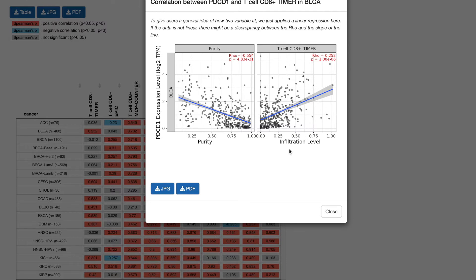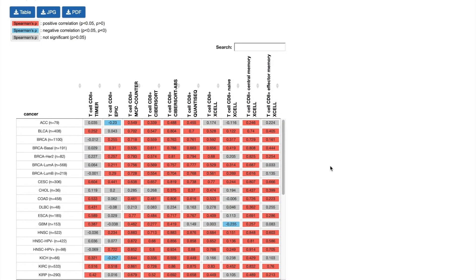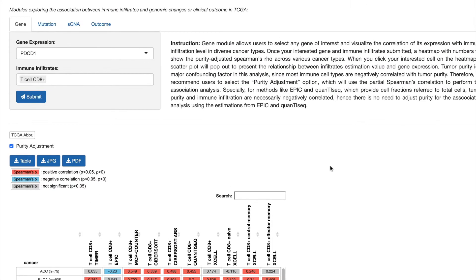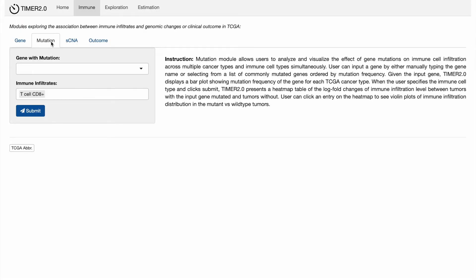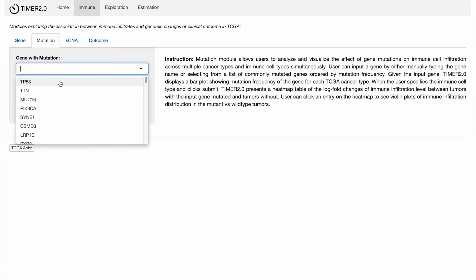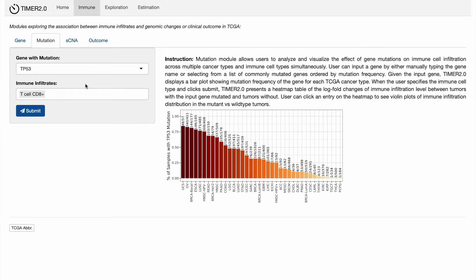That is how we use the gene module in research. Besides gene expression, we could also check the relationship between mutation on a gene and immune cell infiltration using the mutation module. TP53 is a well-known tumor suppressive gene, so we can use it as an example to check CD8 T cell infiltration between TP53 mutant tumors and TP53 wild-type tumors.